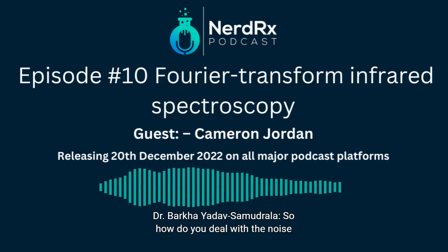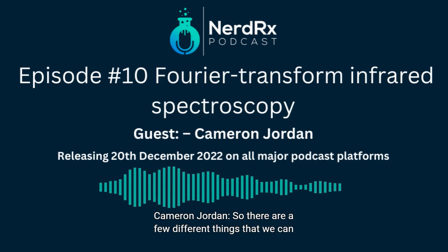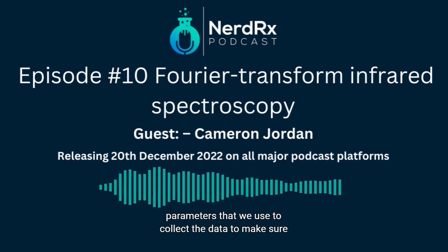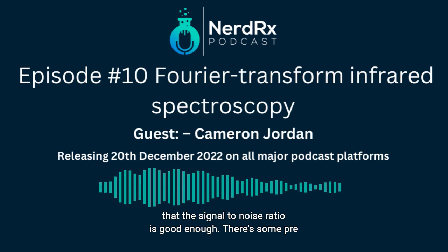So, how do you deal with the noise issue? So there are a few different things that we can do. On the hardware side, we can adjust and change some of the parameters that we use to collect the data to make sure that the signal to noise ratio is good enough.